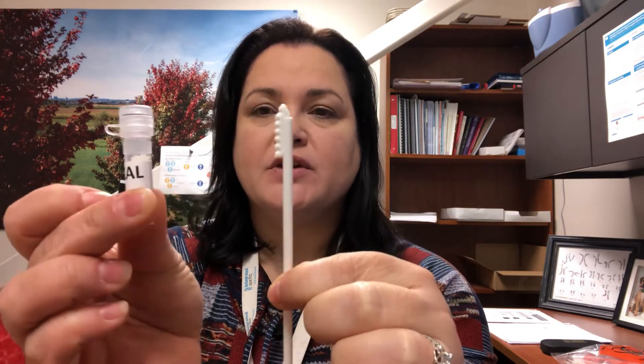This tube is typically labeled 'buccal,' and it's a little tricky because the tube is small. I would recommend that you hold it in one hand while you proceed with taking the sample, just because it can tip over quite easily.